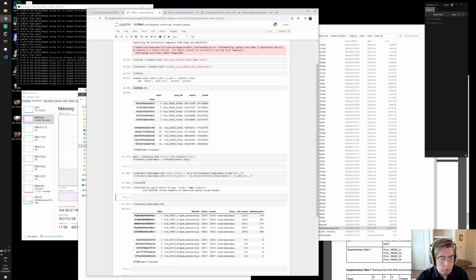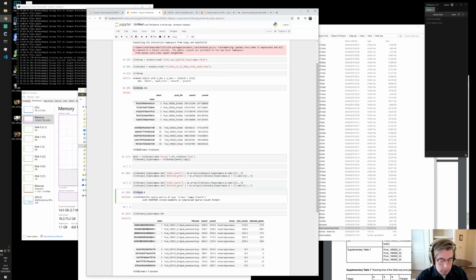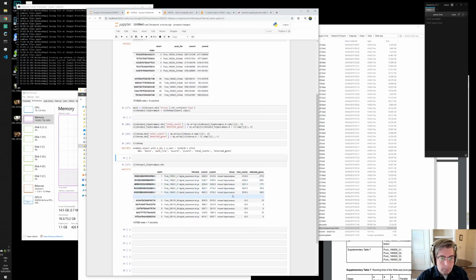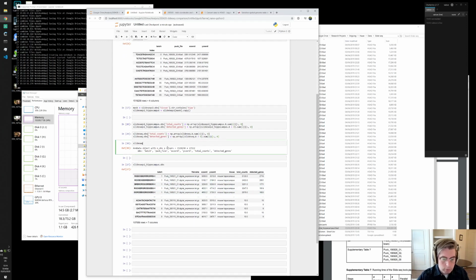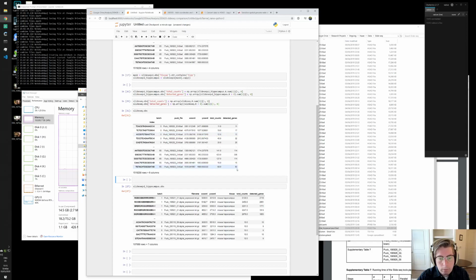The Slide-seq data, of course, is much larger, but because we're storing this as a sparse matrix, it should be pretty quick to calculate. So we just replace the Slide-seq2 with Slide-seq, and it's done. So that way we were able to calculate all of these things for this large 1.5 million data sets. And yeah, that should be it.